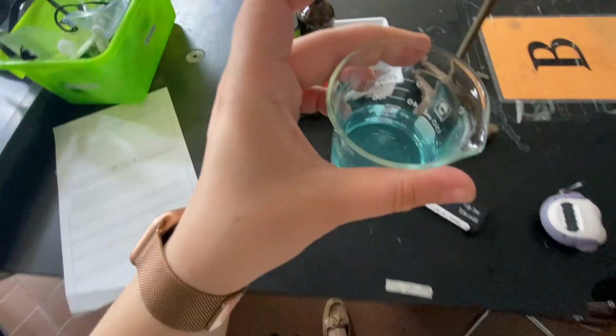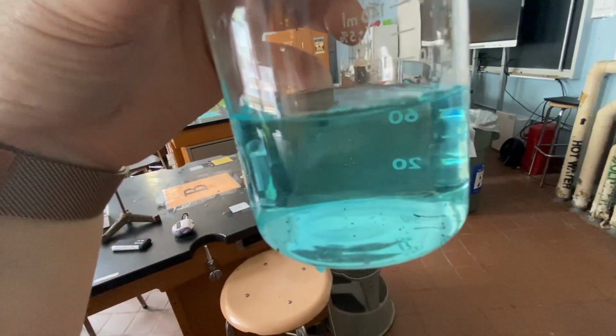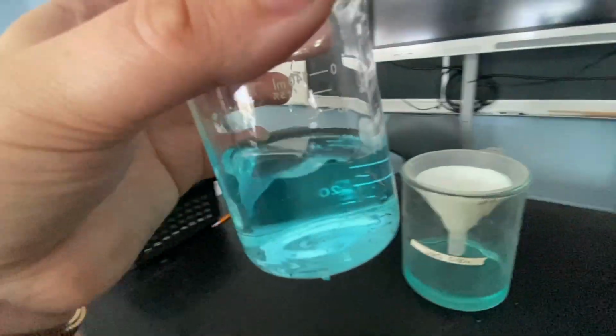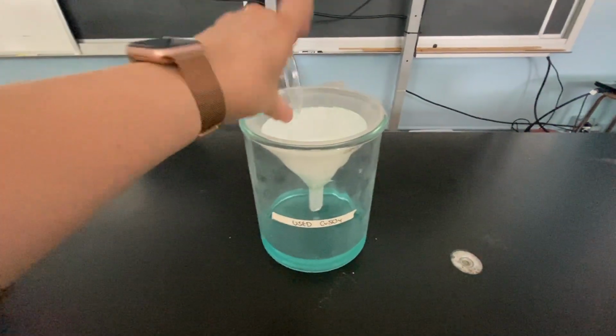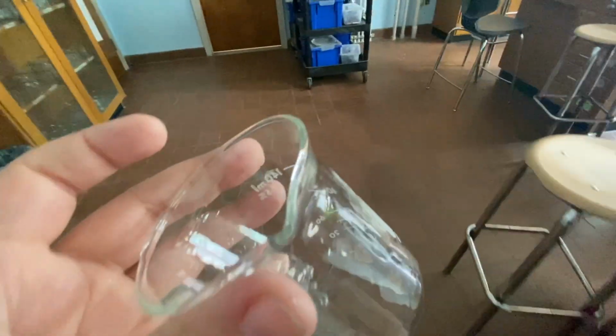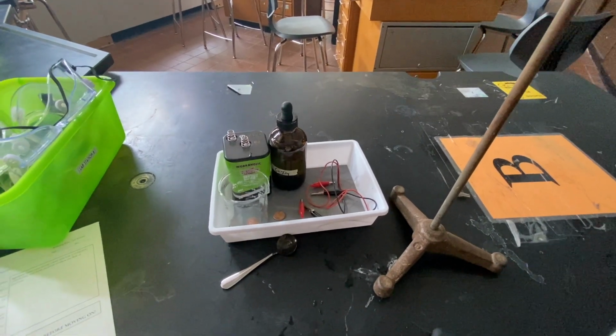Now all of your used copper sulfate, you may have some stuff on the bottom. That stuff is solid copper from the penny. And so that may interrupt our next reaction. So what you can do is take your used copper sulfate, pour it through here, give a little shake, and get all of the stuff out. So then you can return your empty beaker to your bin just like you got it. That's it. Have fun copper plating.